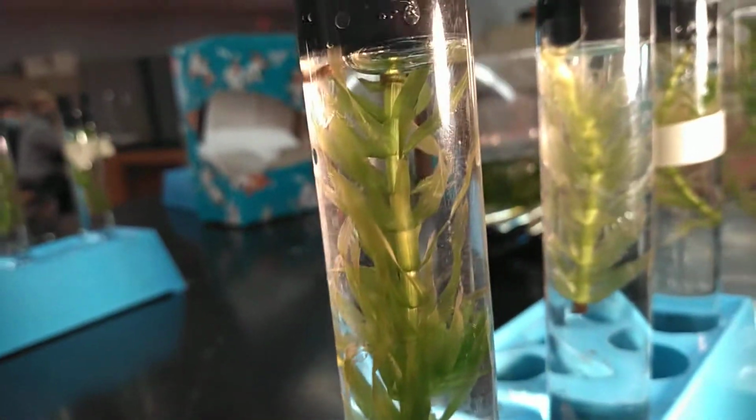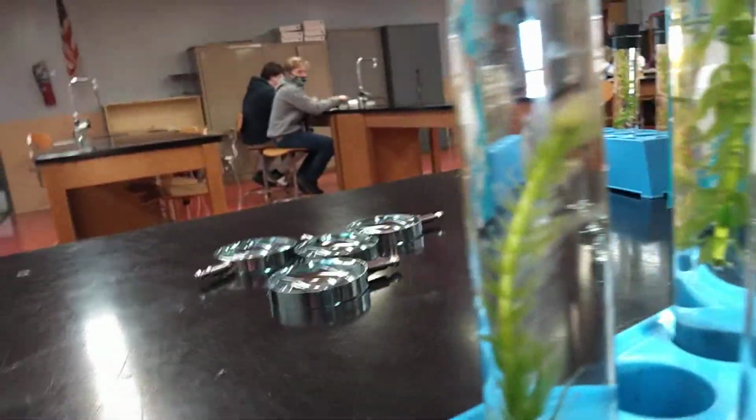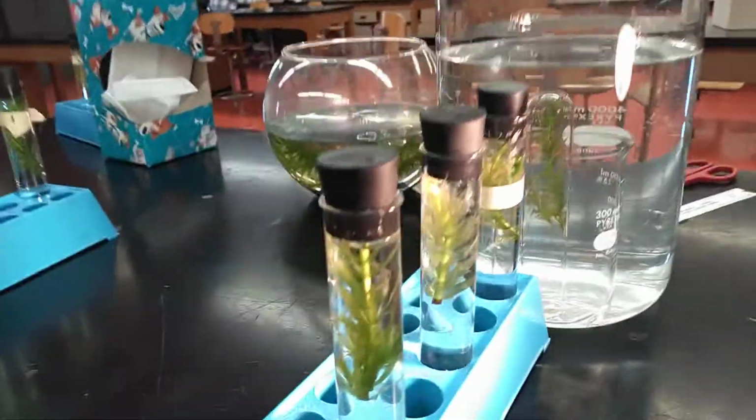These right here are really close to the light. In fact, they're too close to the light. Check out the color for these, but now look at the color for these. They're farther away from the light. They're more of a natural green color because what's happening here, they're too close to the light. They're getting too much heat.